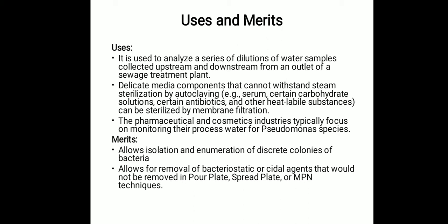Delicate media components that cannot withstand steam sterilization by autoclaving, for example serum, certain carbohydrate solutions, certain antibiotics and other heat labile substances, can be sterilized by membrane filtration. The pharmaceutical and cosmetics industries typically focus on monitoring their processed water for Pseudomonas species. So those are the uses.